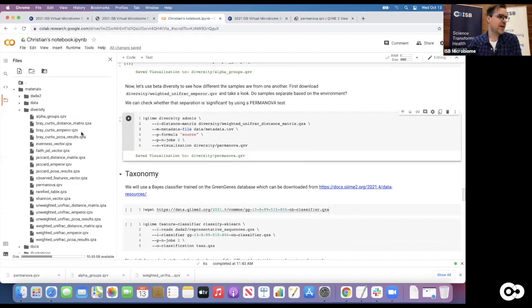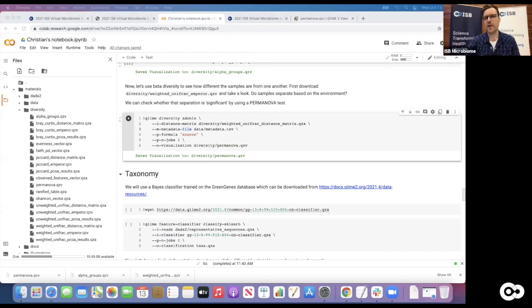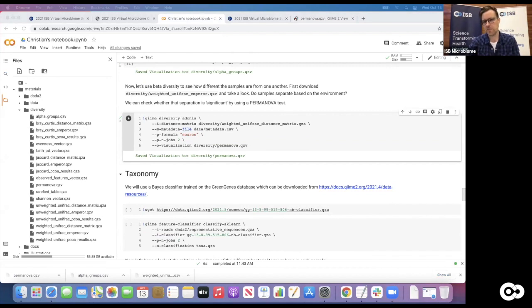So now we've already generated a few insights. We've compared the environments by the composition of the microbiome, seen some unexpected results - the honeybee gut microbiome is closer to the Yucatan cenotes than to the human gut microbiome, which is definitely interesting. We also saw expected things - ocean has a very saline environment and its microbiome composition is definitely very different from other environments, specifically from the human gut microbiome, though it is somewhat closer to the cenotes and soil samples than to human gut microbiomes.